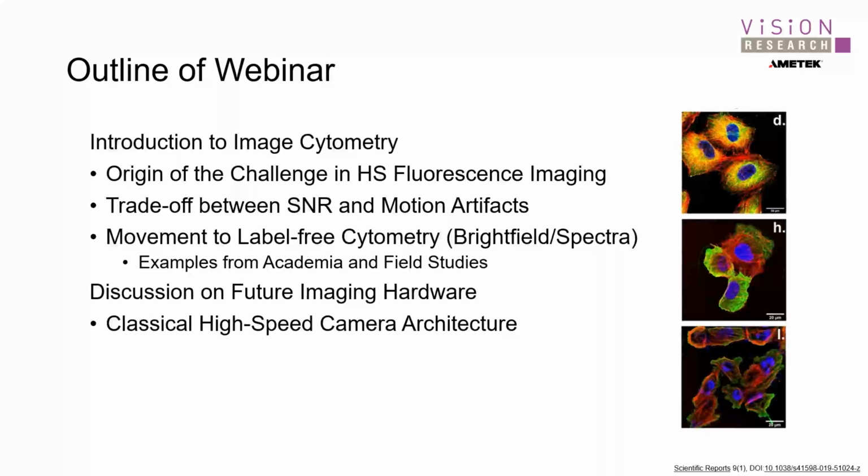That's going to involve a discussion on classical high-speed imaging architectures, and then evolve into a discussion on new age streaming-based cameras and some of their advantages.